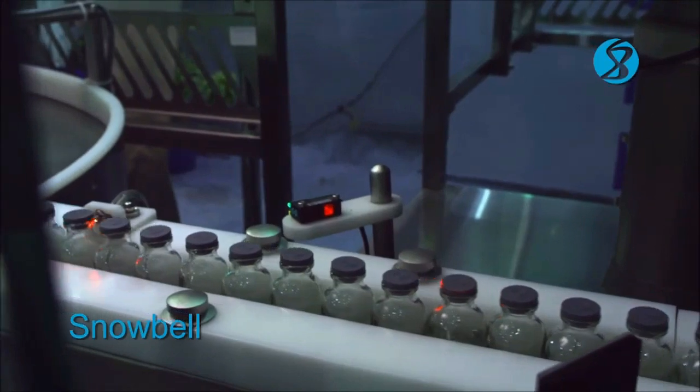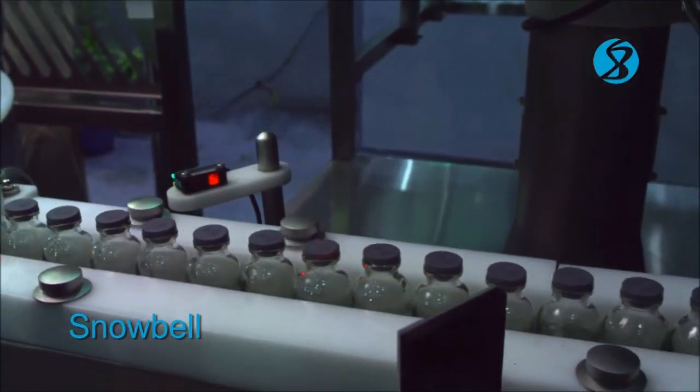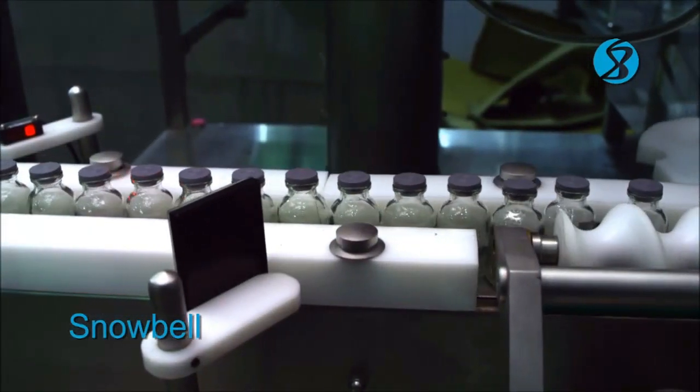The vials are carried by an INFI field star wheel and during the transfer a cap is picked up before entering the machine.